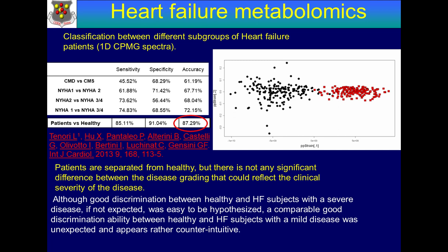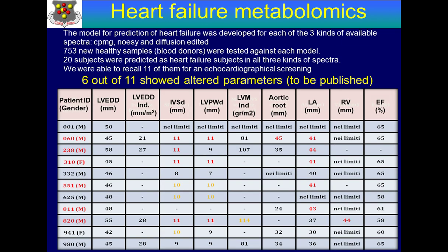The last example is heart failure metabolomics, in which, again, by simple fingerprinting of serum, we could easily tell people affected by heart failure versus normal people. But the interesting thing here was that these people were actually undistinguishable in terms of stage of the disease, from very, very early to very severe. There was no way to discriminate. So it looked like there is a fingerprint of heart failure which is independent of the seriousness and the evolution of the disease, and which might actually be present even before symptoms.